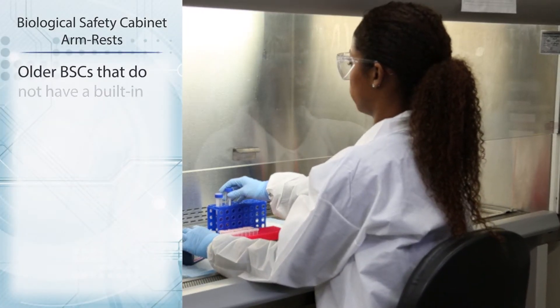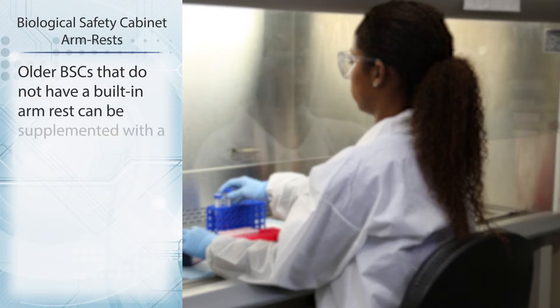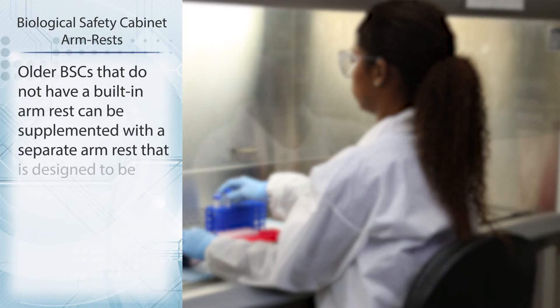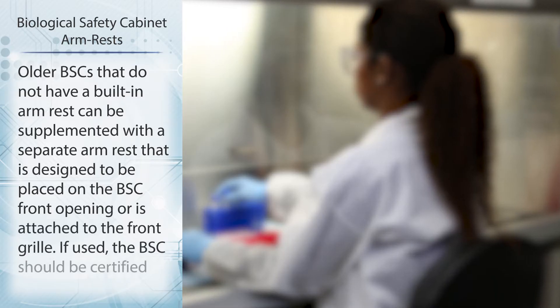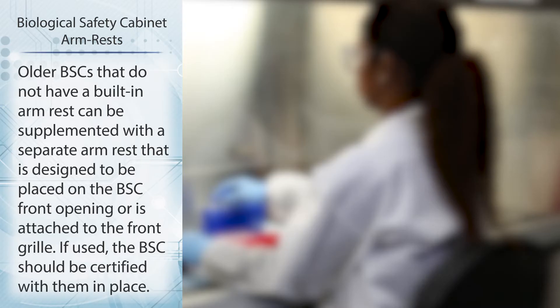Older BSCs that do not have a built-in armrest can be supplemented with a separate armrest that is designed to be placed on the BSC front opening or is attached to the front grill. If used, the BSC should be certified with them in place.